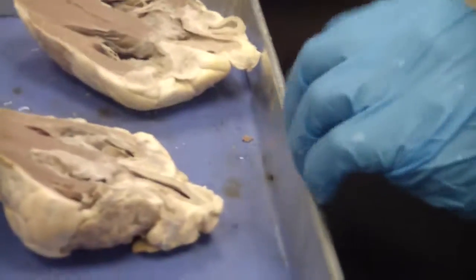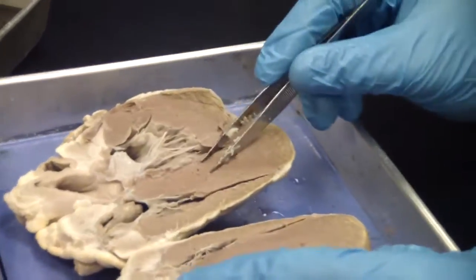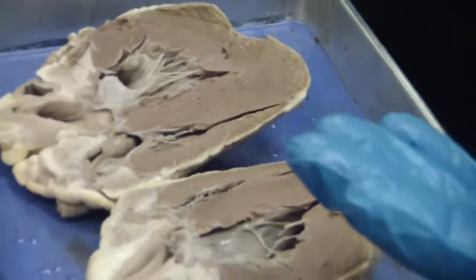Once you cut open, go back to that picture that you had. What you need to do, once again, in the lab practical or whatever, you need to first establish the right and left. And from the inside, if you remember from the lecture room, we said we're going to look at the septum. Like here's the interventricular septum. To the right would be right, to the left would be left. Yes, that's one way.